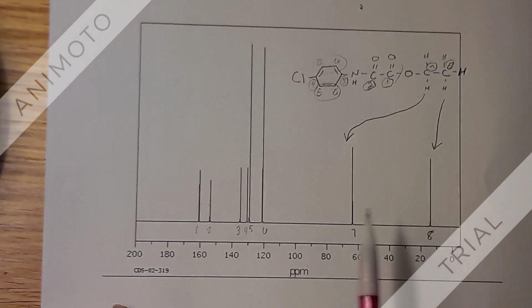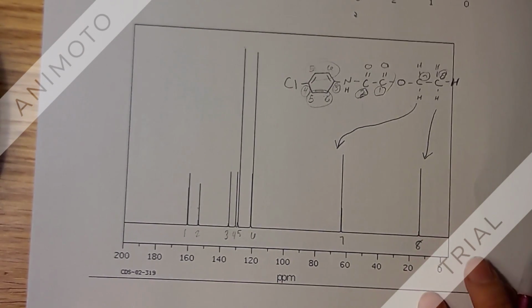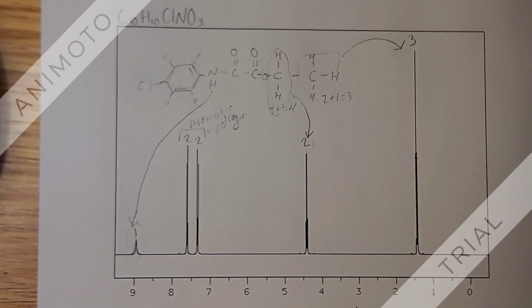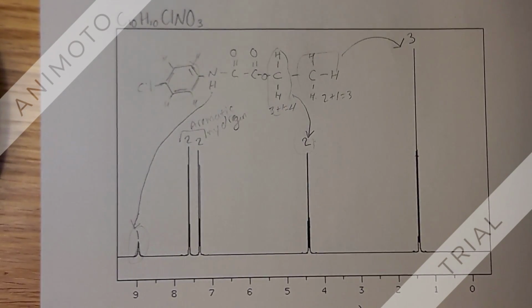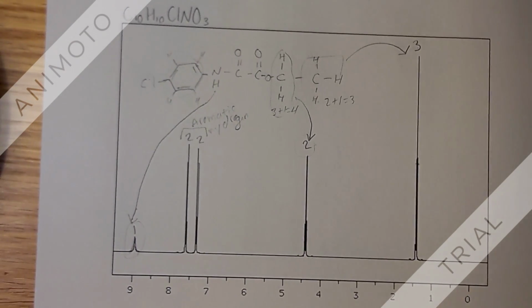But our deshielding matches with the structure. So it tells us that this structure that we drew up here is the correct structure for our molecular formula, and it matches all of our graphs.